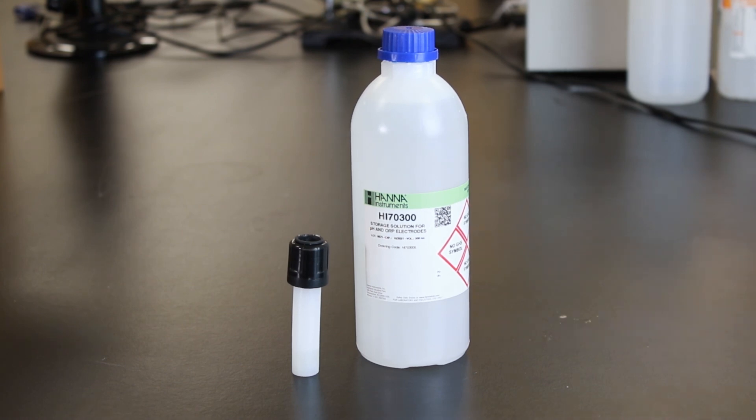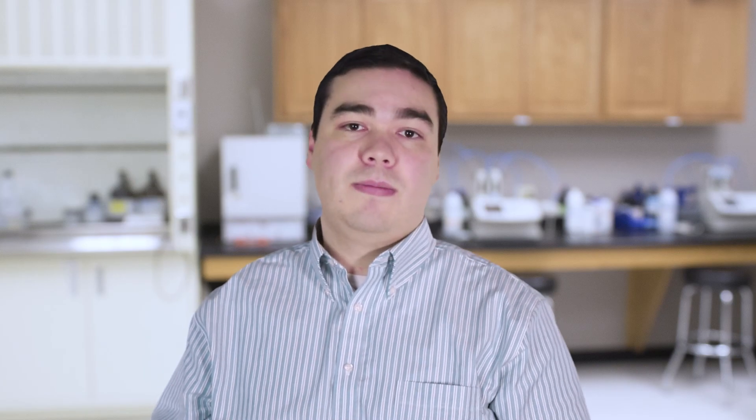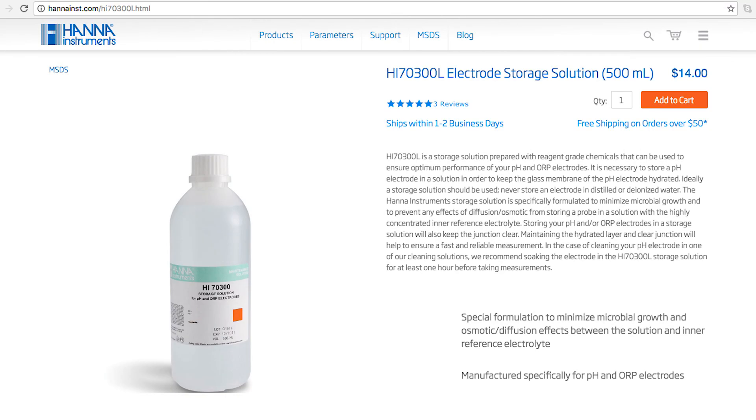Without proper storage, the electrode gets dehydrated. It's best if you rinse and store your electrode after every use. We recommend our HI70300 bottle of storage solution. If you don't have storage solution, pH 4 buffer works too.